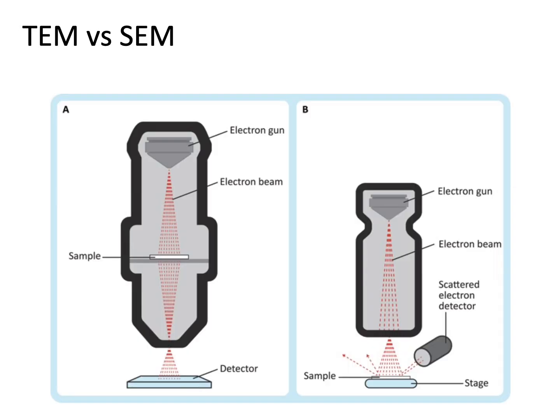Right, so here on the left is where you have a source of electrons. So it's usually a coil that has power run through it, and the coil emits electrons. And they go through your sample. So this is the transmission electron microscopy. It usually requires a lot more work than light microscopy, where you have to fix the samples and you are cutting them super thin.